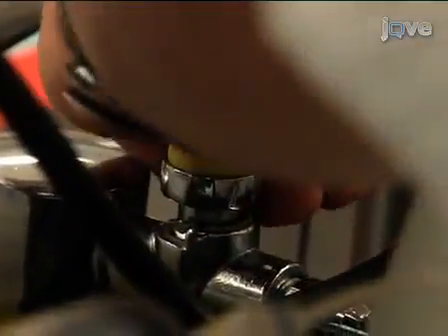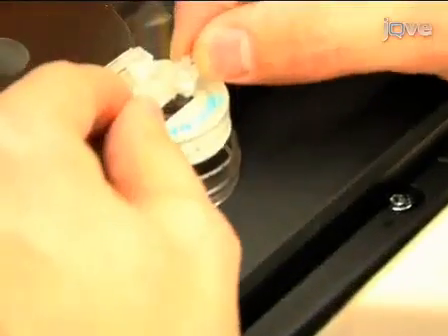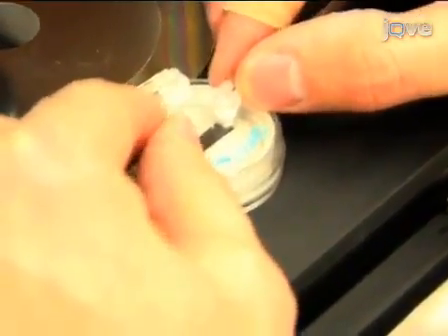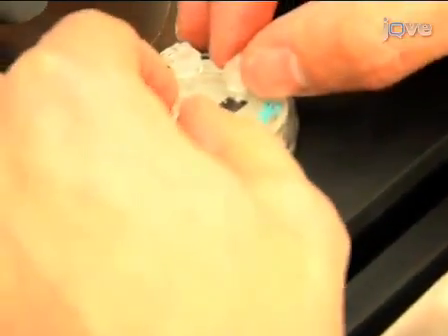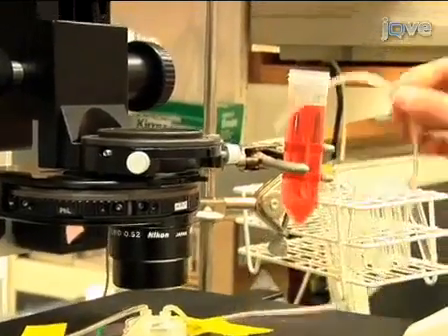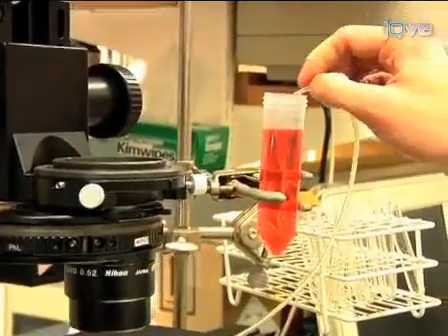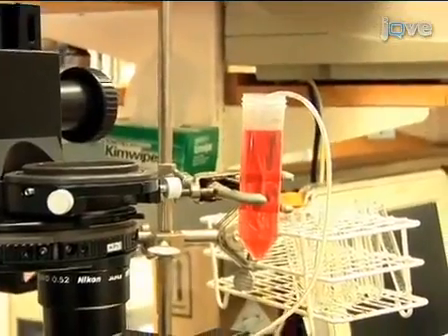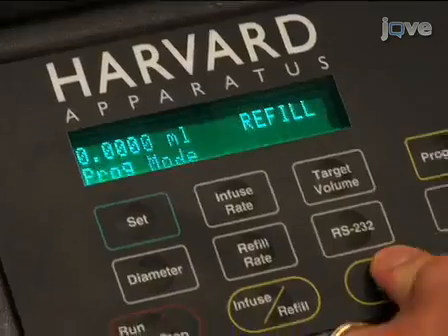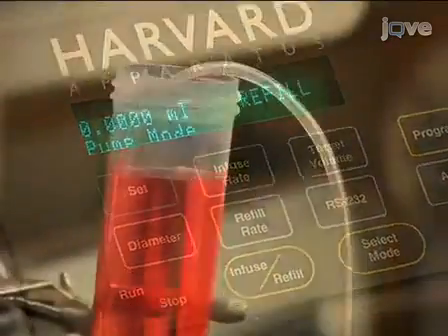Turn on the vacuum. Gently lower the flow chamber apparatus onto the plate and allow the apparatus to suction down. There should be no sounds of air escaping, and at this point you may need to apply pressure to the chamber to compress the rubber gasket. Once the vacuum has been established, place the input tube into the 50 milliliter conical tube. Open the three-way stopcock to the 60 ml syringe and place the pump in pump mode.